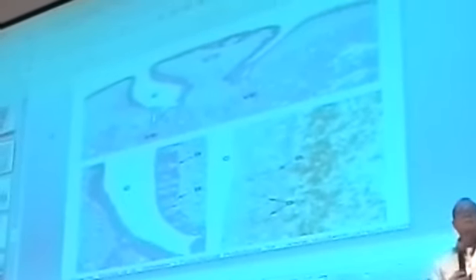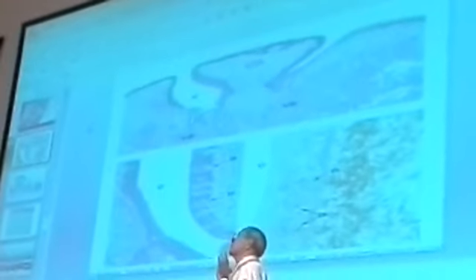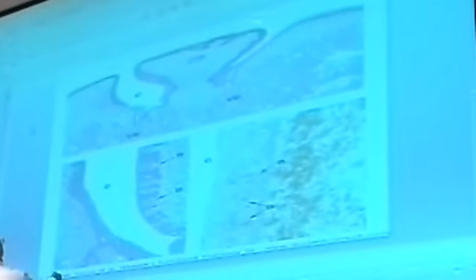This is another papilla. What is the type of this papilla? Circumvallate papilla. Where can you find circumvallate papillae? Along the sulcus terminalis. They are the largest type of papilla. Each one is surrounded by a groove, so they are called circumvallate papillae.